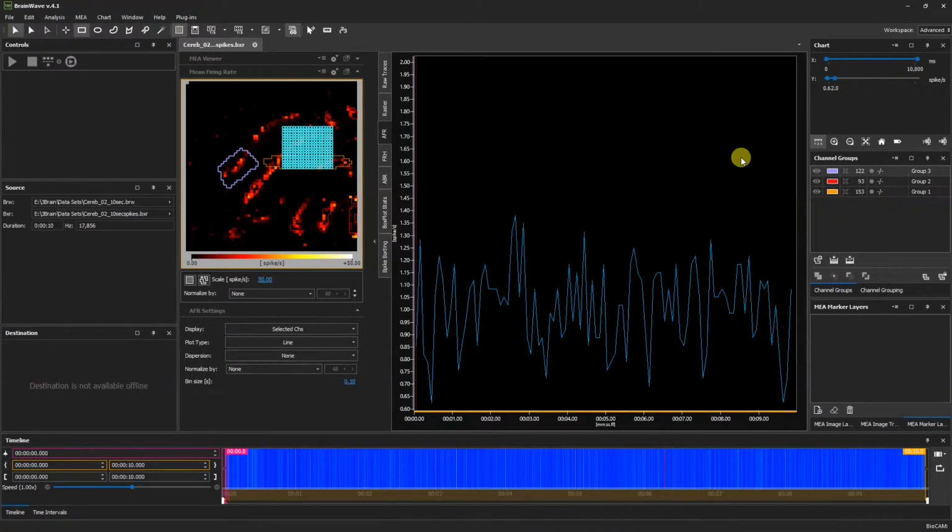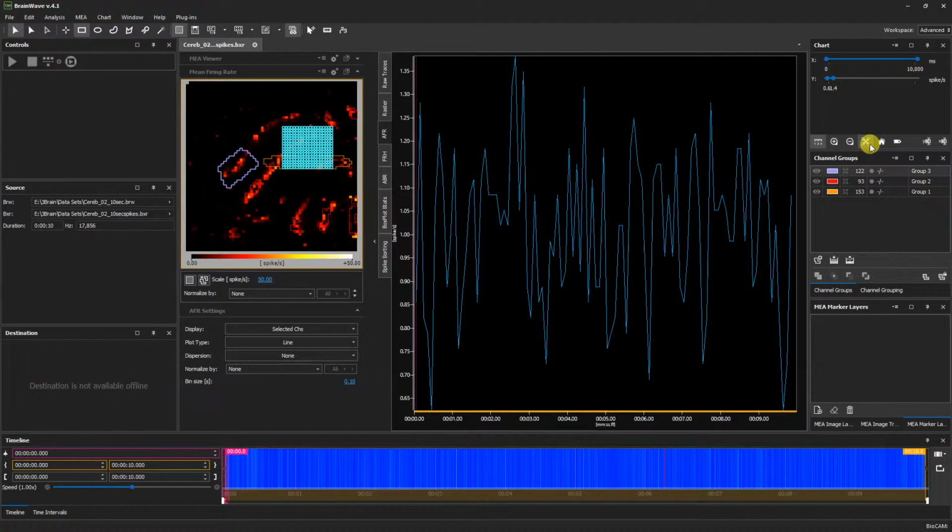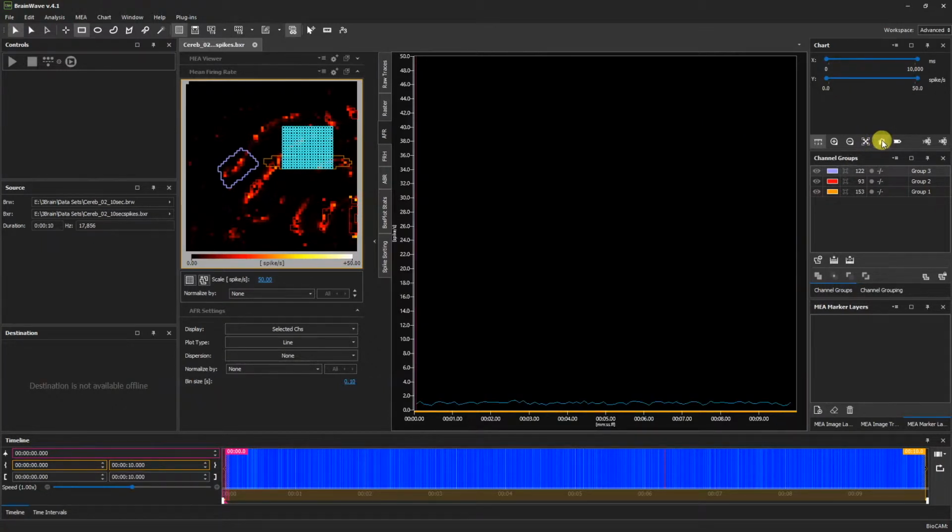Like the raster plot analysis, we can also modify our Analysis tab window. For example, by clicking to zoom in, zoom out, show or hide ticks, and using the auto scale feature to optimize our data visualization. To reset our visualization options, we can click Reset Axes.